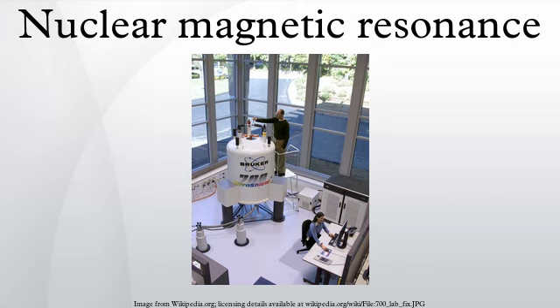External links. Tutorial: NMR MRI Tutorial, NMR Library, NMR Concepts, NMR Course Notes. Animations and Simulations. This animation shows a spin, the modification of spin with magnetic field and HF pulse, spin echo sequences, inversion recovery sequence, gradient echo sequence and relaxation of spin.